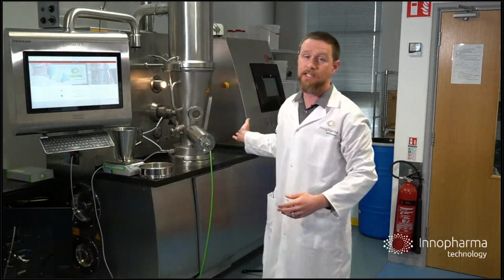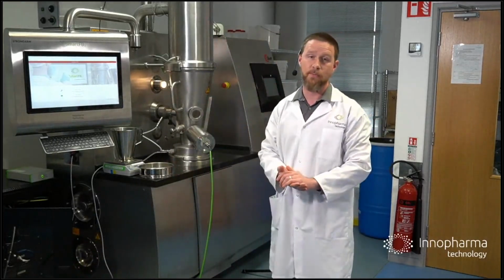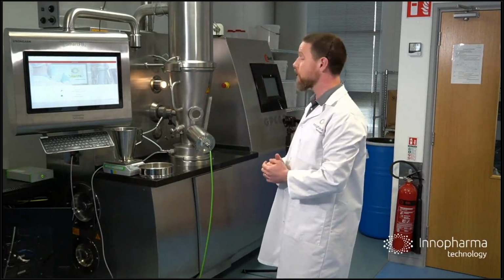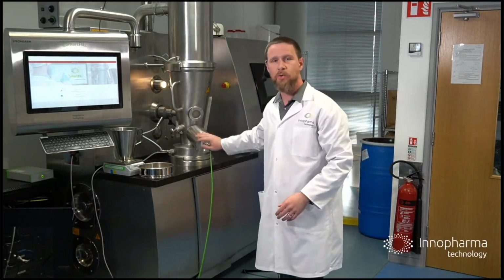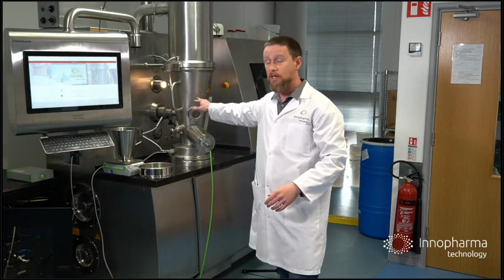All right, so behind me, you can actually see a bit of process equipment. This is our GPCG2. It's a fluid bed granulator, coater, and dryer. Today we have it running in its coater configuration. And if you haven't spotted it yet, this little green cord is leading up to the ICON 2, and it's measuring real time in this process.